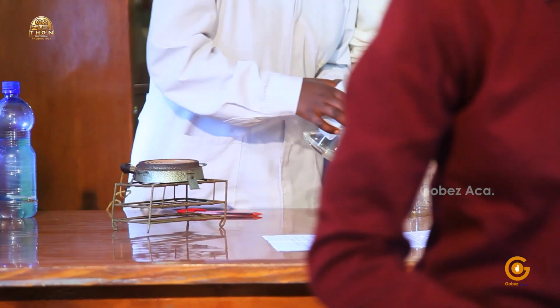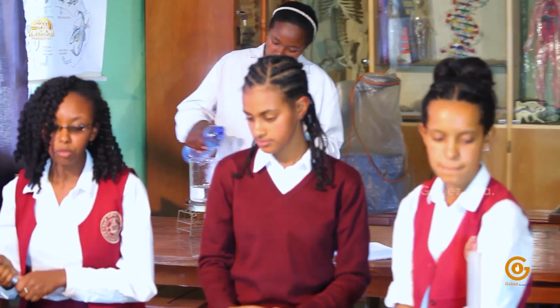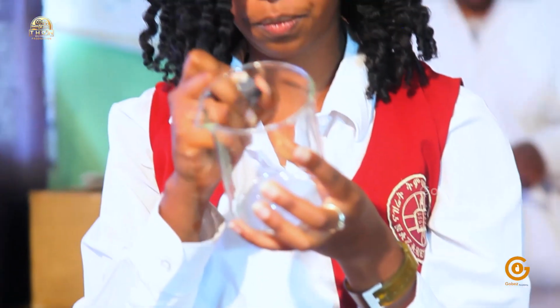We require more boiling water for this experiment. Like before, I write hot water on the third beaker.